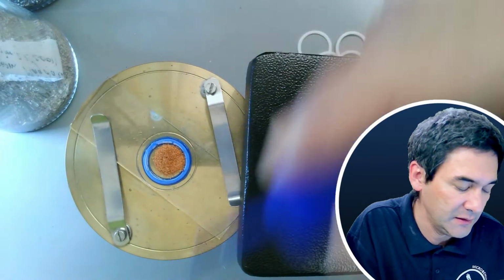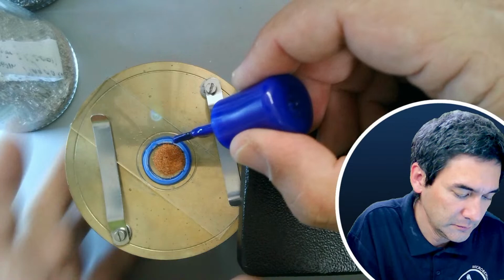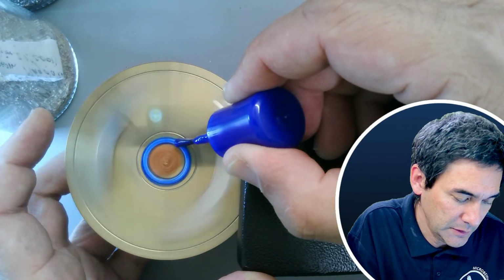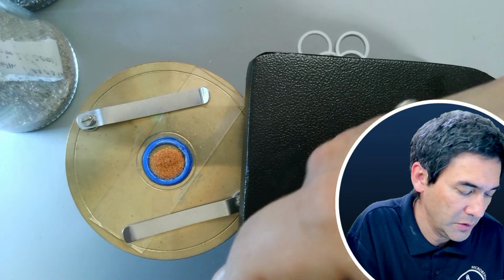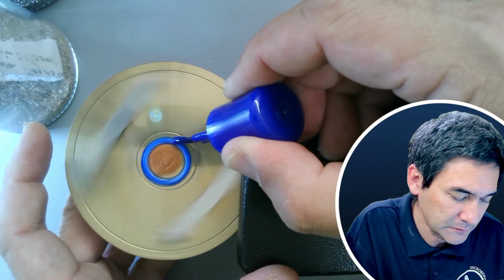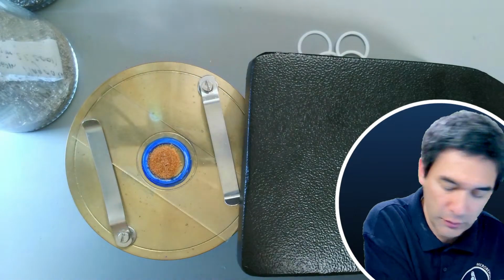I'm going to apply a second layer. Maybe a third layer. One shouldn't wait too long, because after all, the nail polish is drying rapidly. Yep, let's give it a try.